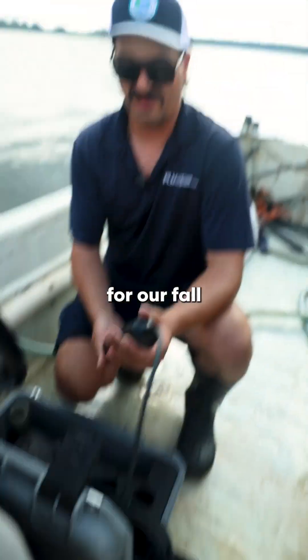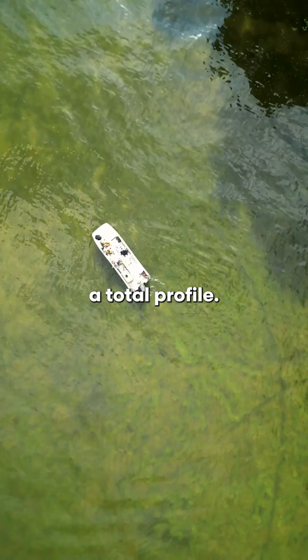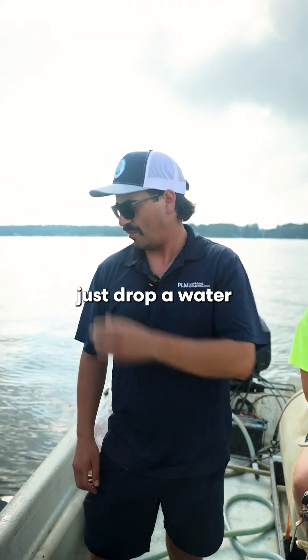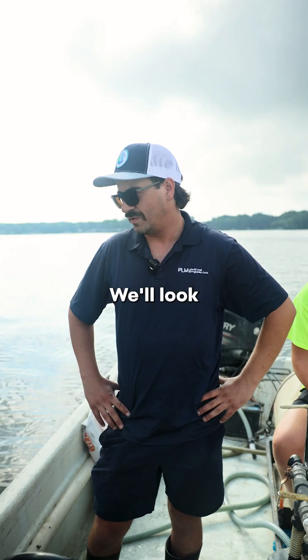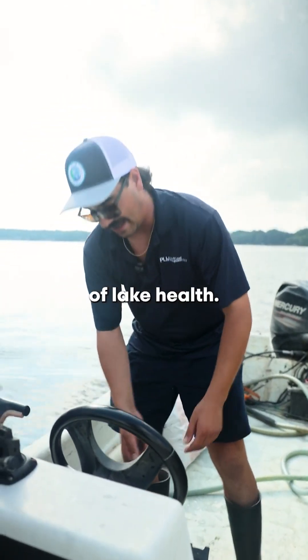Right now we're setting up for our fall water quality testing. We do this in the deep holes on our lakes so that we get a total profile. You can go online and look at these for any of the Great Lakes through NOAA. We essentially just drop a water probe down and measure pH and oxygen levels above and below the thermocline — every meter. We'll also look at conductivity, turbidity — really just a full profile of lake health.